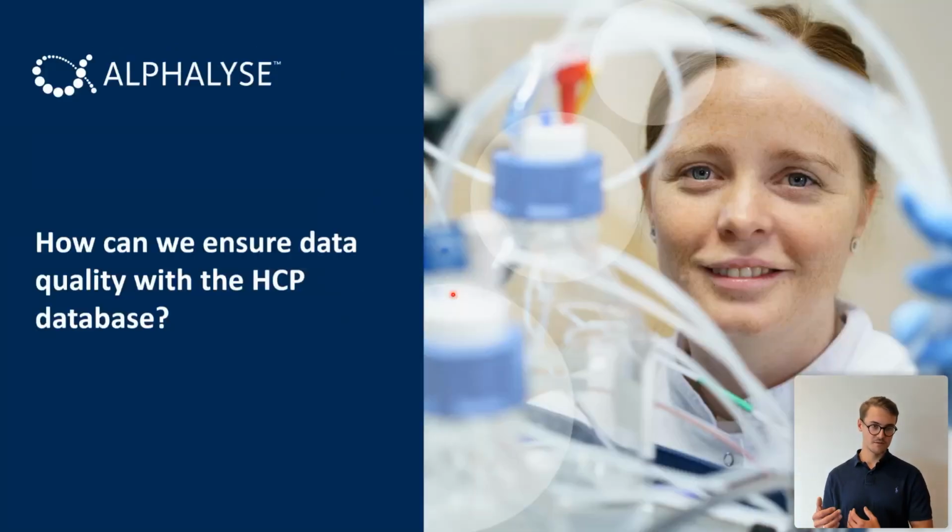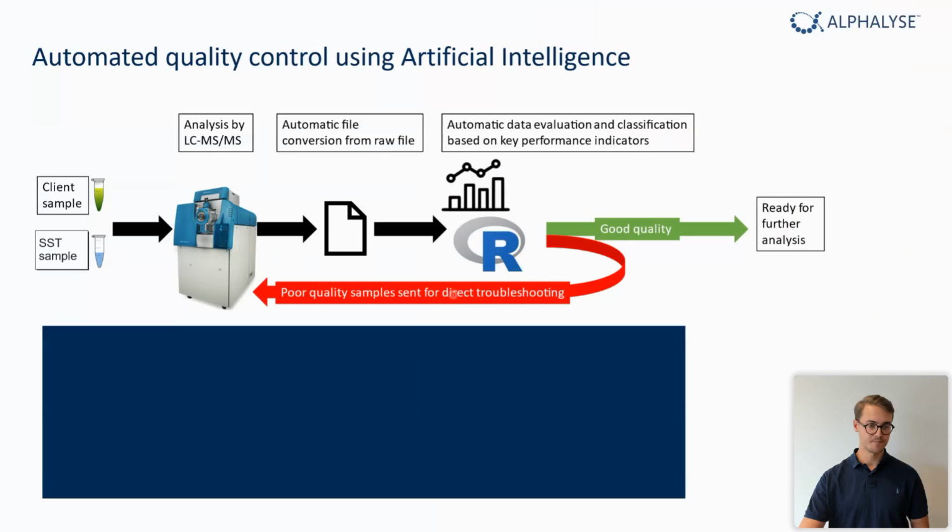So now I've shown you some of the things we can ask this database, just kind of like the tip of the iceberg. And with all of this data and the increasing amount of this data which will be generated, we need to ensure both the quality of the data, but also the quality of the analysis. So how can we do this with this database? So the way we approached this process was actually to create an automated quality control pipeline using machine learning.